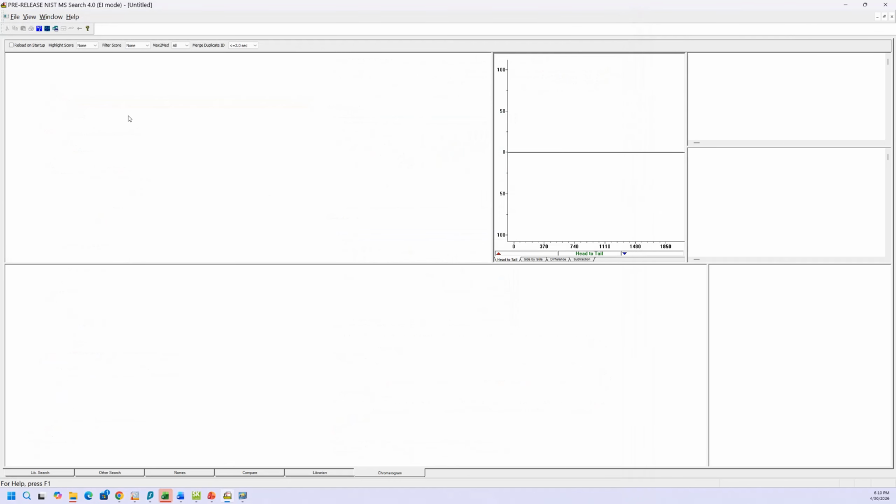So after we get in here, we have to set up which one you're going to do. Since on my system I have both, you can select the spectrum type, and if you put any, I will see both of them. If you have one or the other, it's probably just best to pick one. So select the spectrum type, and this video is on EI, so we'll pick it. And now it simplifies the menu.